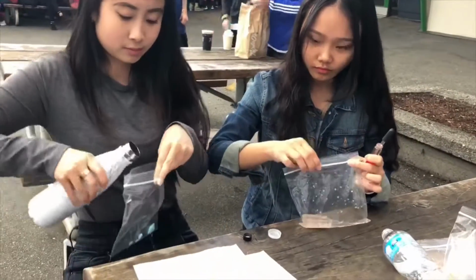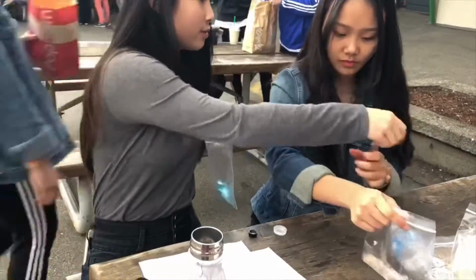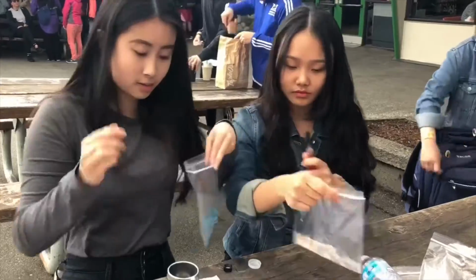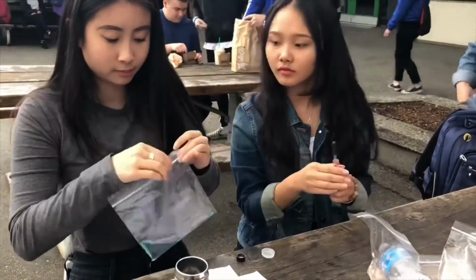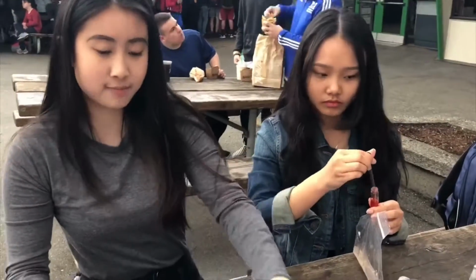At the end, fat was found in the patty, fries, and bread. Fat was not found in the popcorn or the cotton candy. With the results we have received, we found that none of the tests of the food samples were surprising.